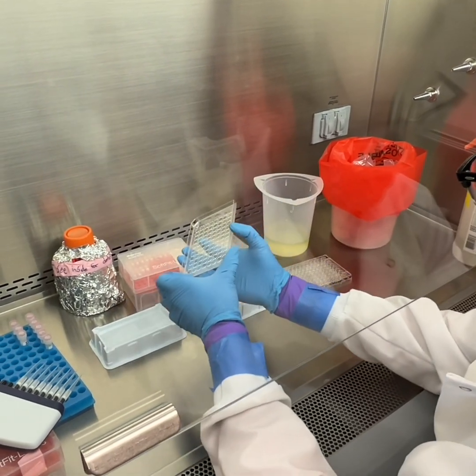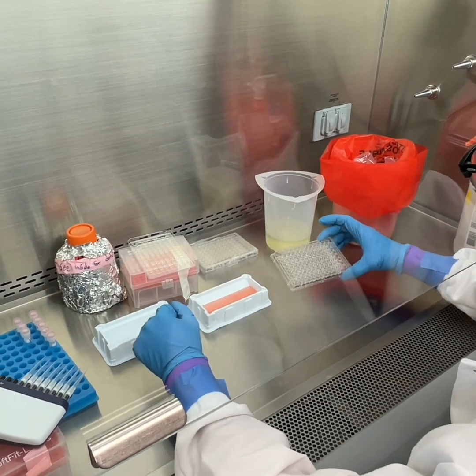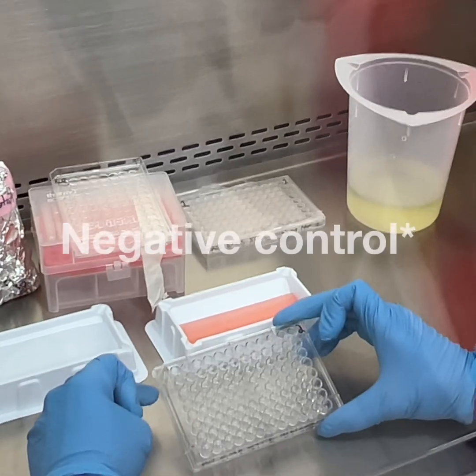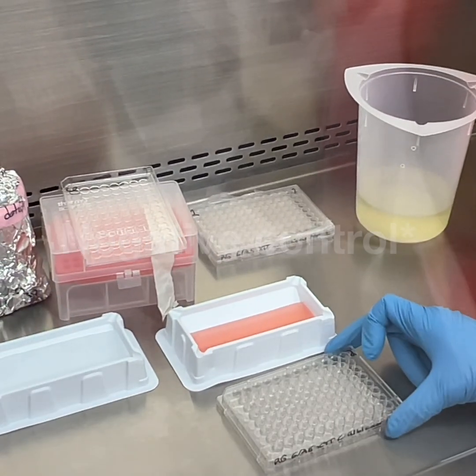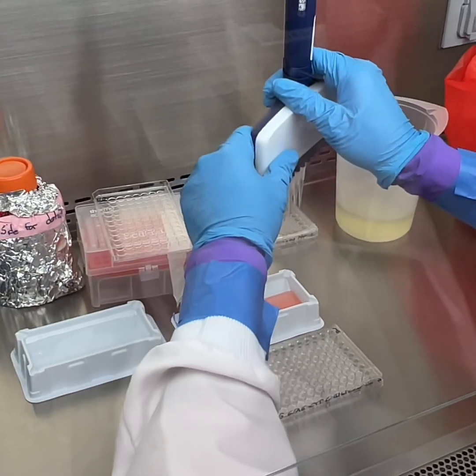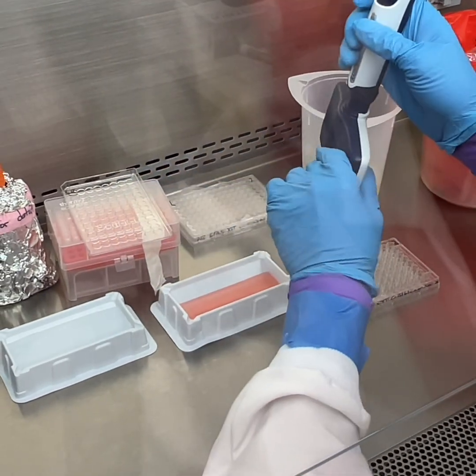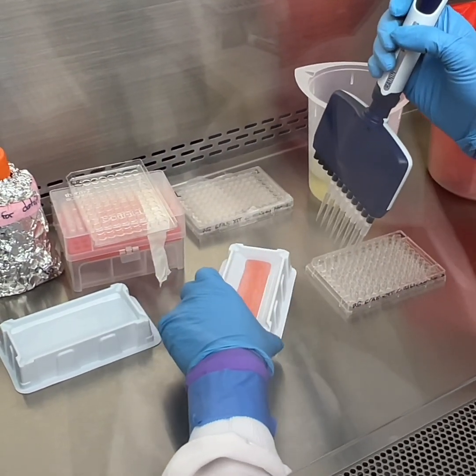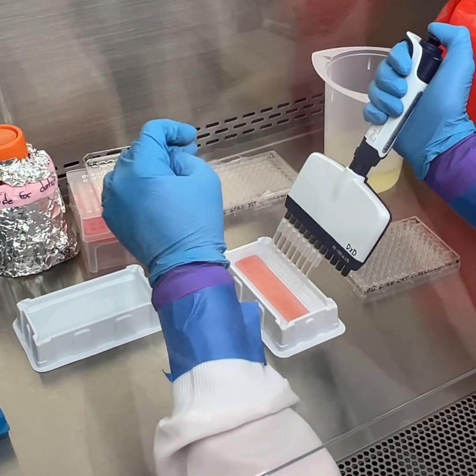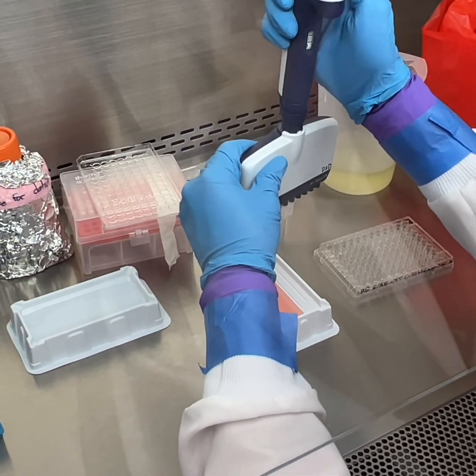Now I'm going to add 100 microliters of RPMI to every lane except lane 1 and lane 12, our positive control. This will be what's actually making the dilutions, the 1 to 2 dilutions, when we serially dilute. Make sure you're at 100. Almost forgot.